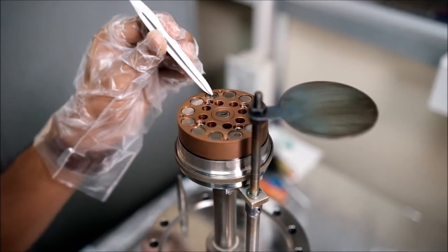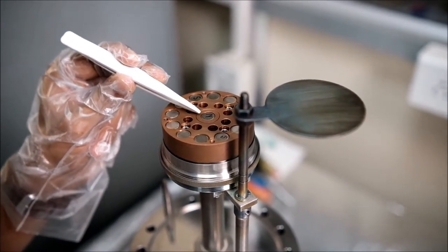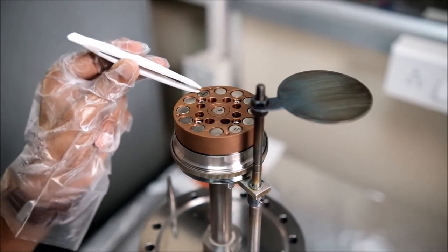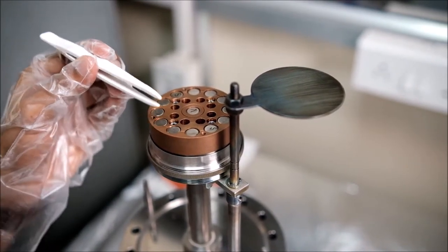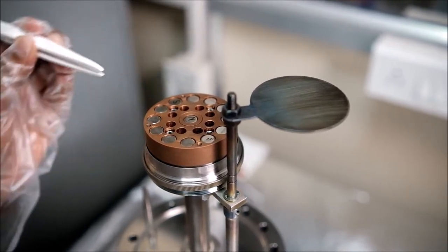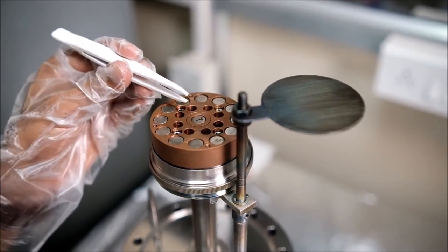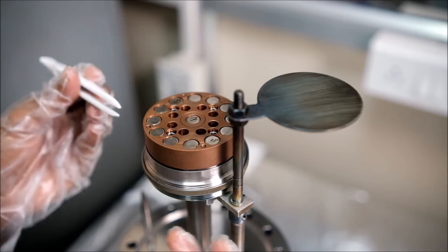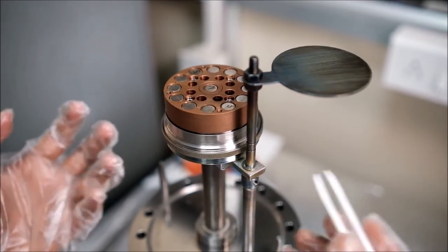Here we have the outer ring magnets and the core magnet. The core and the outer ring are oppositely faced — if the outer magnets are south pole faced, then the inner core will be north pole faced. Thus a magnetic field is created that lines from north to south pole. This magnetic field traps electrons and makes the electron path elliptical, increasing the electron mean free path so that more ionization happens from argon to argon-plus.